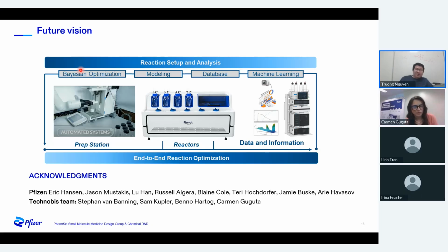I think in one unit we have a camera. It's not something we fully apply into a workflow, but we try to develop using a camera to do more than just looking for physical properties.